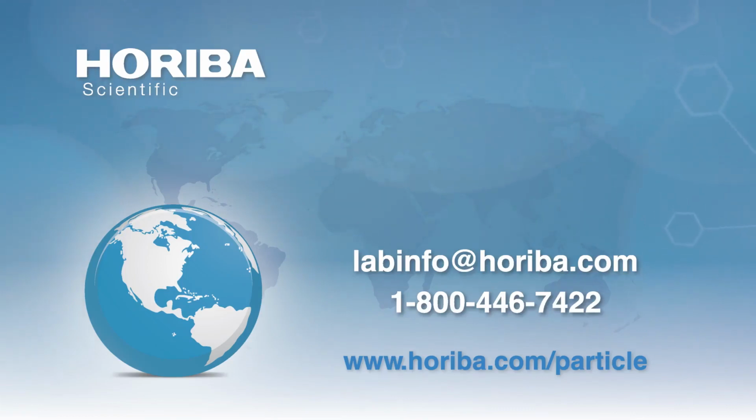No matter what you do, because of the broad nature of charge, it's not a single number. That's why when you measure, you get a distribution of charge, and you overlay it. And like everything else, the broader the distribution, the more problems you might have when you're mixing materials, and the narrower the better.